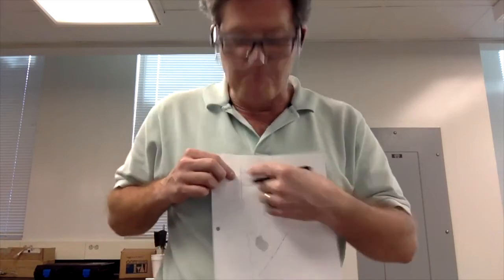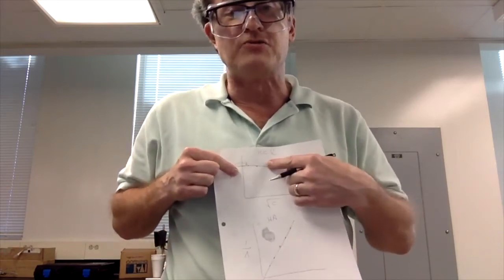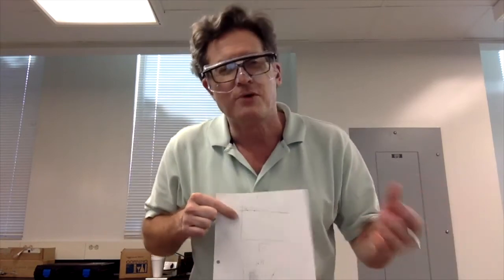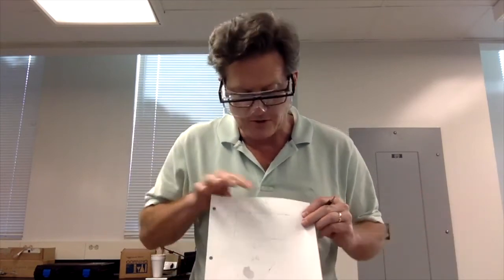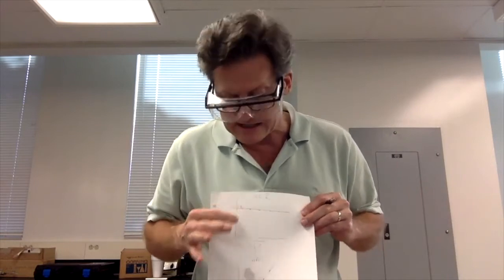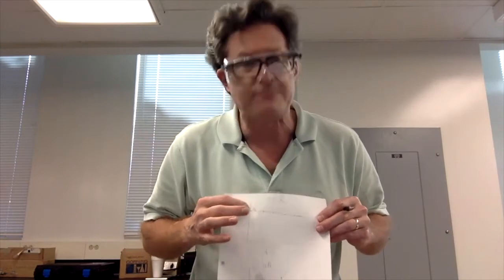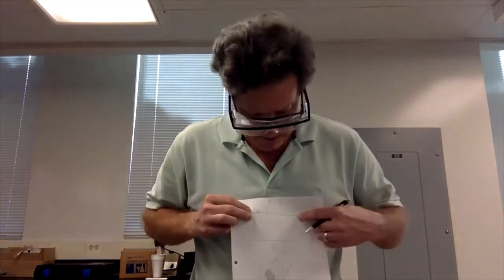Now, if you have a big value that you're measuring and you have a very small offset, then it's not a big problem with measuring an intercept. So if you have large numbers and small offset, no problem. We can measure an intercept and it should be accurate, right? We've got a very flat line and it's a large value. This intercept is a good way to measure.